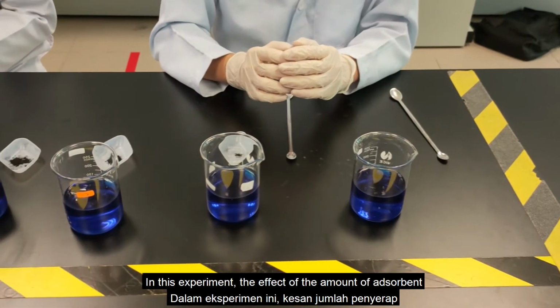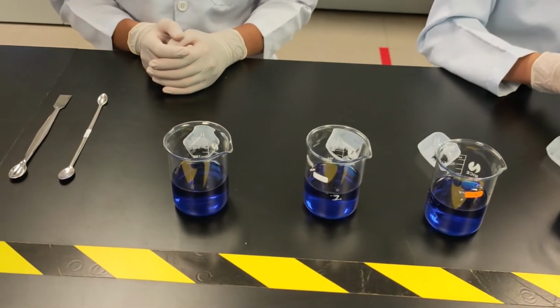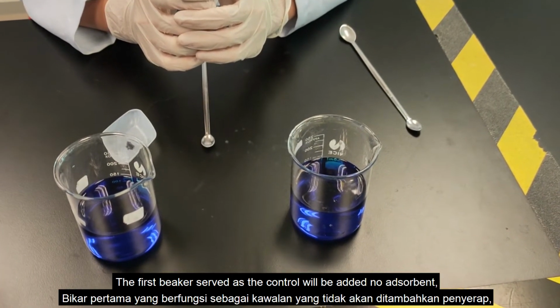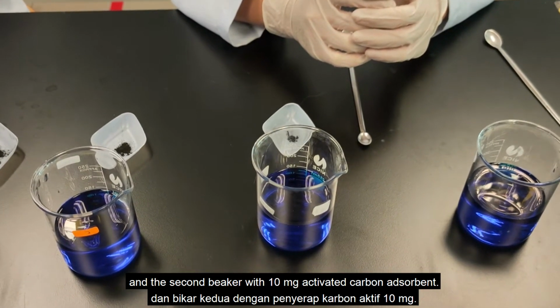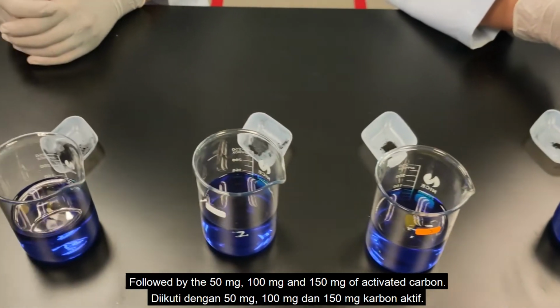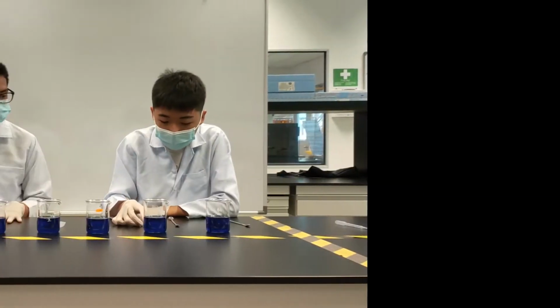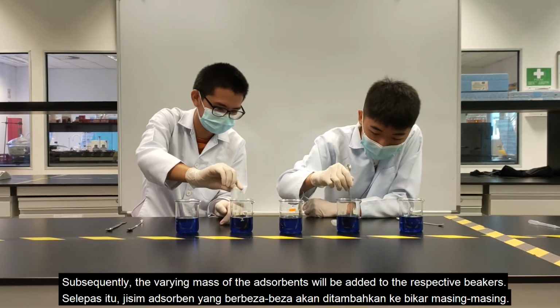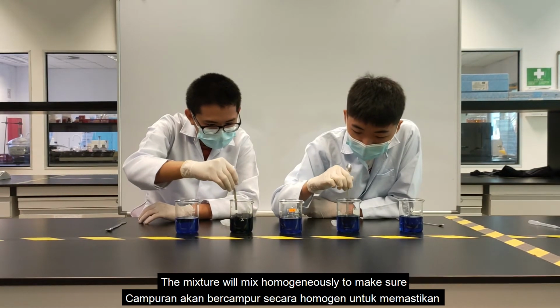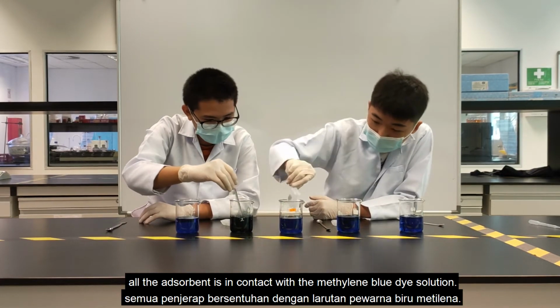In this experiment, the effect of the amount of adsorbent on the methylene blue dye solution will be tested. The first beaker served as the control and will have no adsorbent added, and the second beaker will have 10 mg of activated carbon adsorbent, followed by 50 mg, 100 mg and 150 mg of activated carbon. Subsequently, the varying mass of the adsorbent will be added to the respective beaker. The mixture will be mixed homogeneously to make sure all the adsorbent is in contact with the methylene blue dye solution.